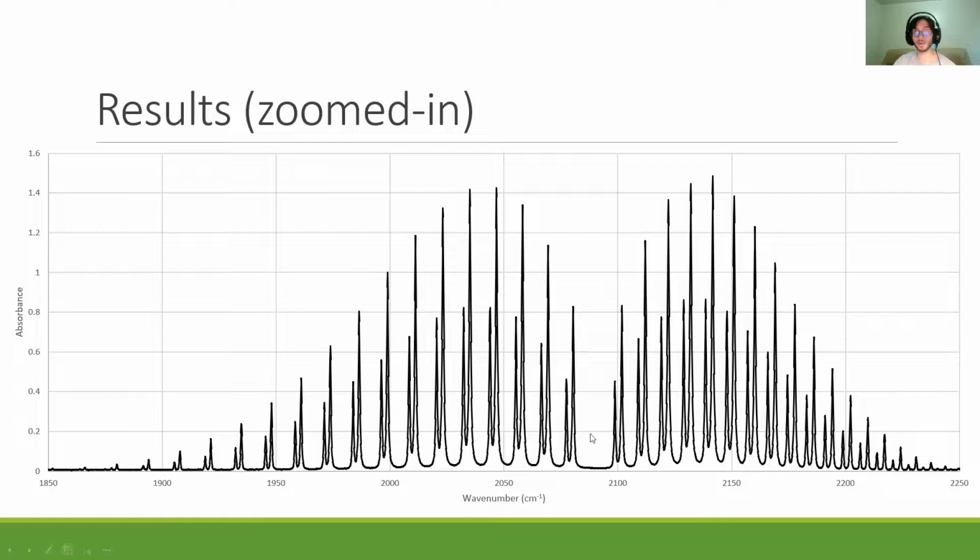There are a couple of things to point out here. One of them is that we do have some splitting here, and that's because chlorine also naturally has two isotopes that we see. But since the difference of a couple of neutrons is going to matter much less for chlorine than it does for a small atom like hydrogen, the split is much smaller. So we really just see it at the rotational level, and it's very small.